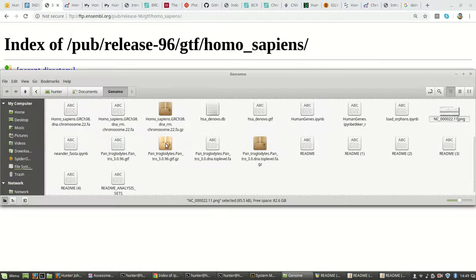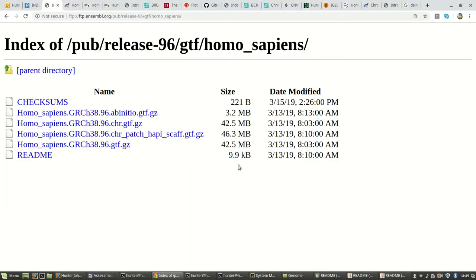Let's check in my thing and, crap. Well, this is not the best place to do it. Sorry the screen is so busy.